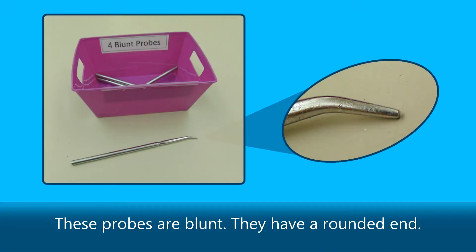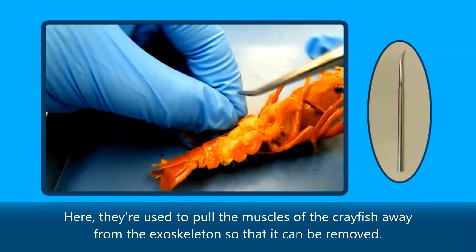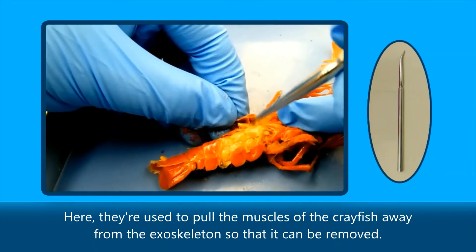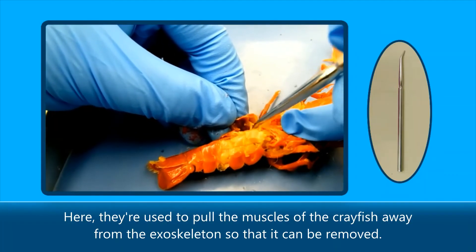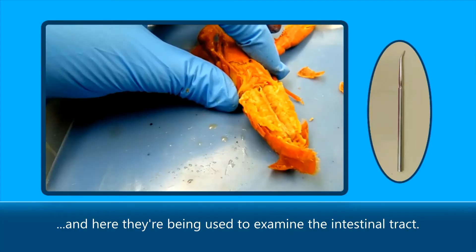These probes are blunt. They have a rounded end. They're a little less precise for pointing, but they're more gentle to the tissue of the specimen. Here they're used to pull the muscles of the crayfish away from the exoskeleton so that it can be removed, and here they're being used to examine the intestinal tract.